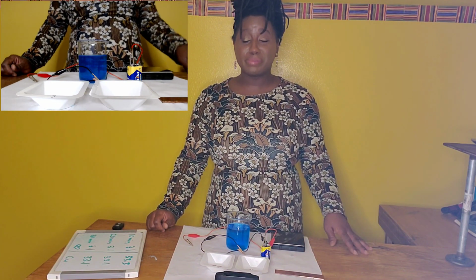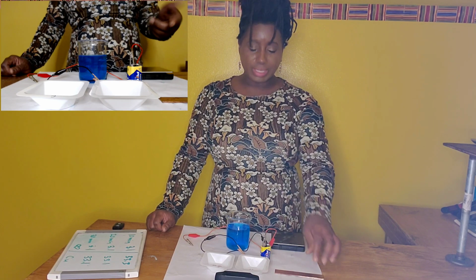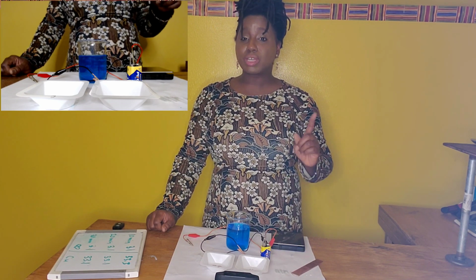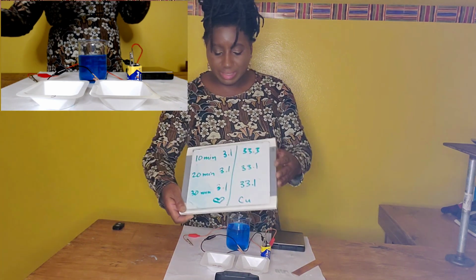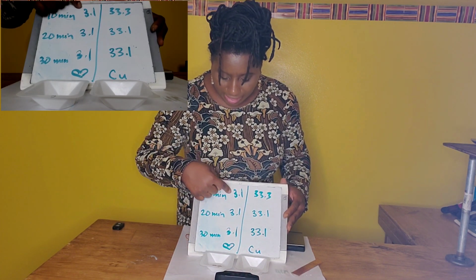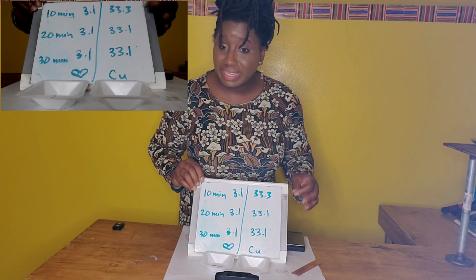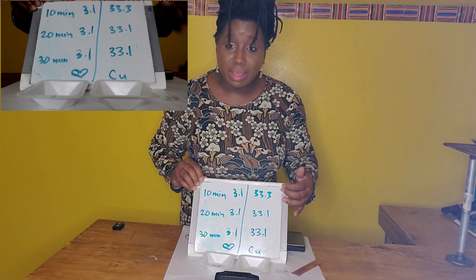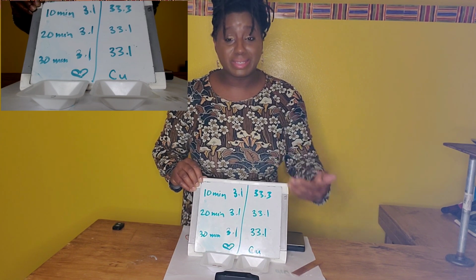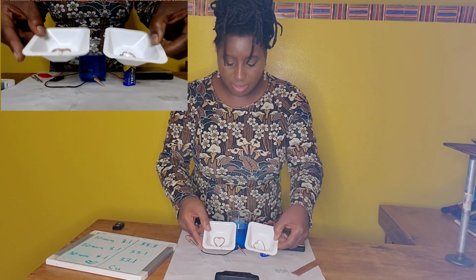Welcome back, y'all. It's been about 30 minutes since the electroplating process began. After every 10-minute increments, we took out the copper electrode and the heart-shaped pendant and we measured its mass. Remember, we were expecting a change in mass where we weren't quite sure. But this is the data of our lab. What do you notice here? There was not any change in the mass of the heart-shaped pendant. And there was an insignificant, but a change nevertheless, of the copper electrode. So yes, I want you guys to write your analysis of the data in the comments section.